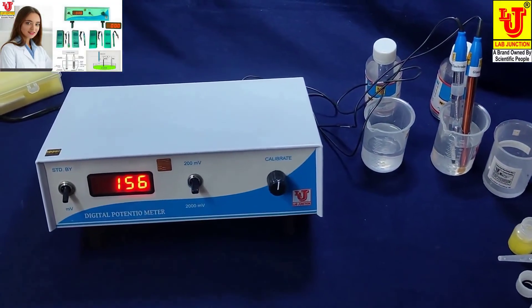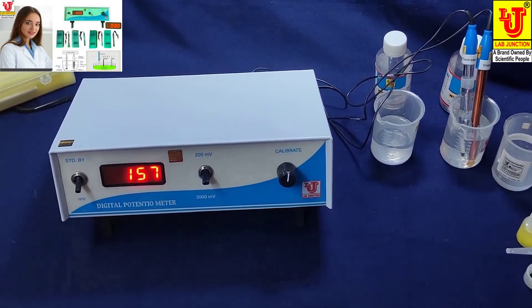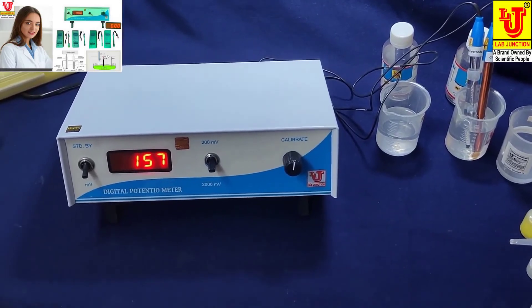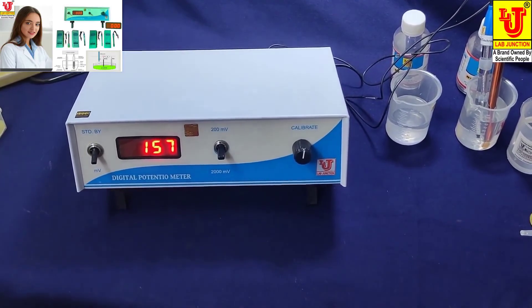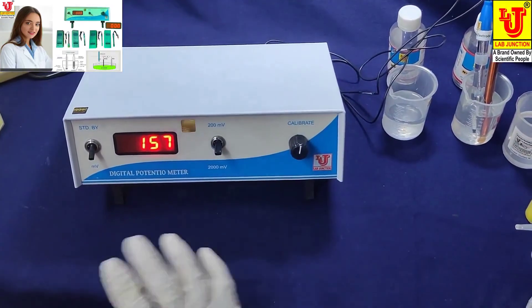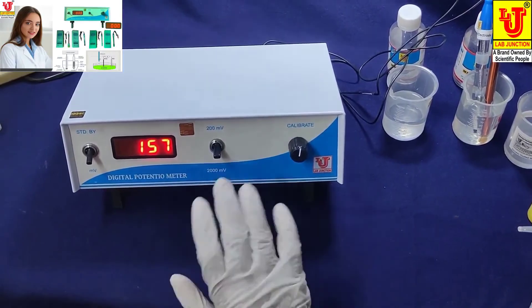Refresh both electrodes with distilled water and tissue paper, then dip directly into your testing solution. Results are displayed on the instrument display. In this range, no need to switch between 200 and 2,000 millivolts — use 2,000 millivolts directly.